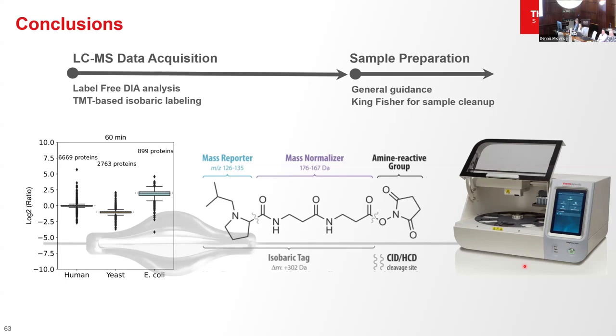You're measuring something, but you might be measuring one specific glycoform on one protein, or a glycoform that's been cleaved on a protein. So there's ambiguity there, but for targeted validation and follow-up, I think there's no question that mass spectrometry is the way to go, because as you mentioned, you can spike in a synthetic, stable isotope labeled peptide and compare.